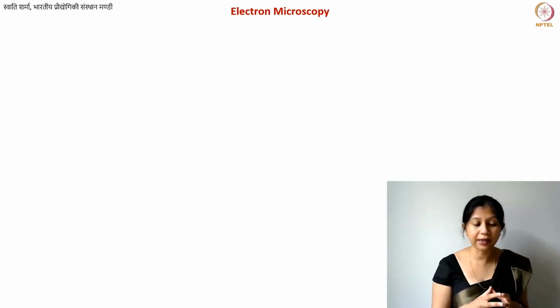One important thing, which I will probably tell you again in this lecture, is that TEM should not be your only analytical tool. Whenever you've made a carbon material, whether it is nanotubes, graphene sheets or a bulk carbon, in all cases TEM should be more like a supporting technique, and it should not be the only technique. X-ray diffraction often gives you a good average of the crystal structure of the entire material. In transmission electron microscopy, you're often looking at a very small region, and there also the interpretation is not all that straightforward. This is what we are going to discuss.